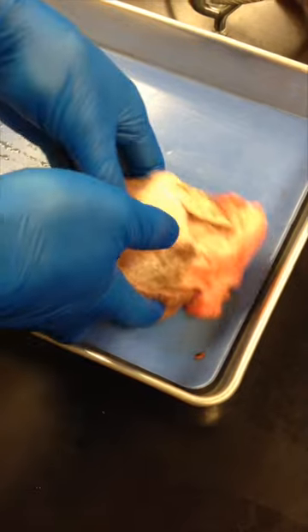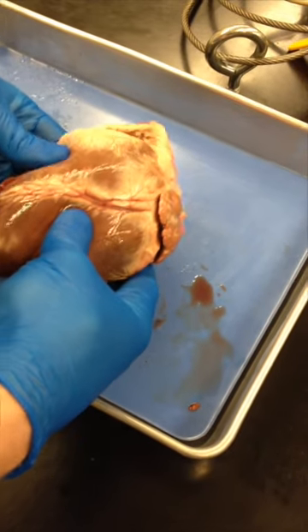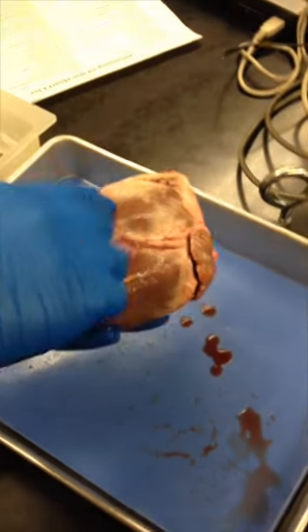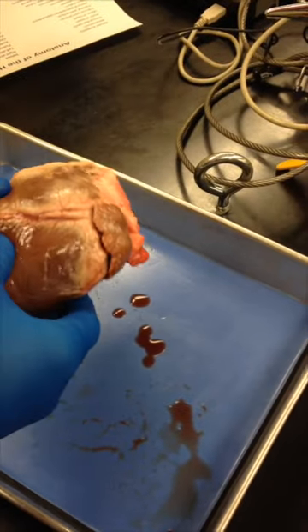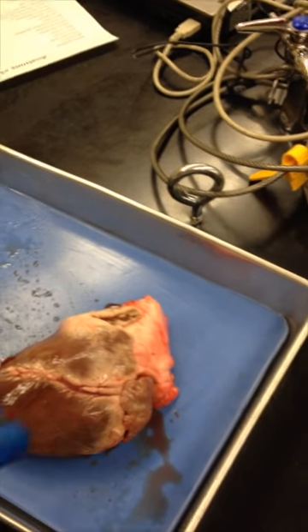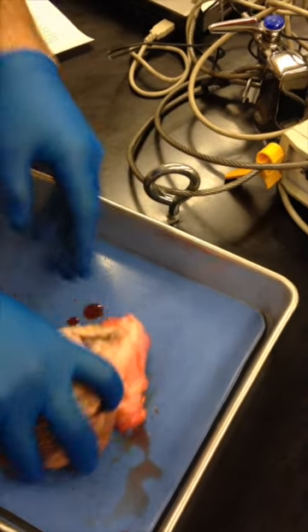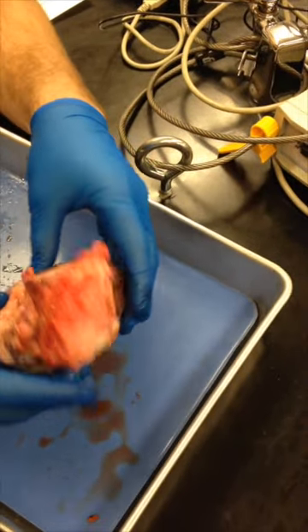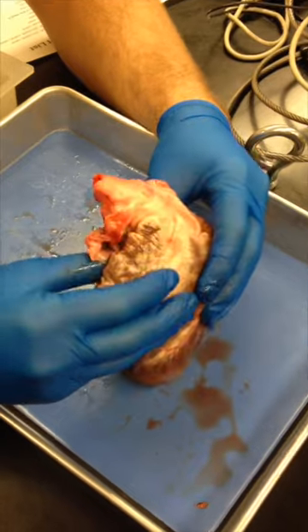So, as it sits, the side of your right hand should feel thicker than the side of your left hand. This is the right. To me, it feels like that's thicker and that's a bit softer, yeah. Just grab it. If that is the case, it's going to sit like this. Yep, and the body goes in my body.